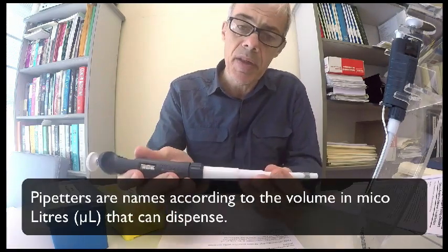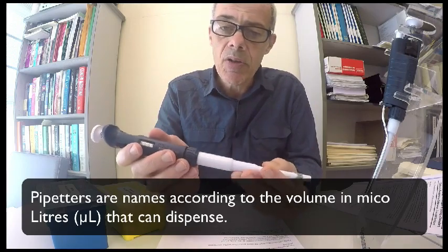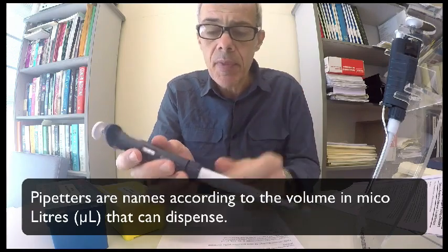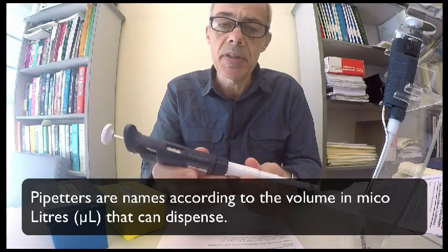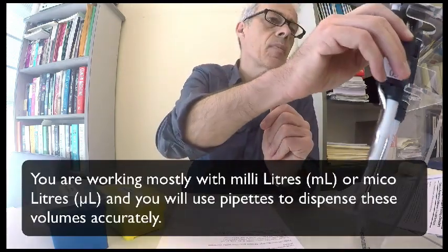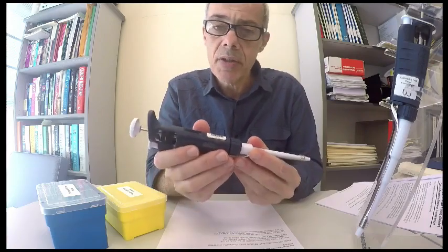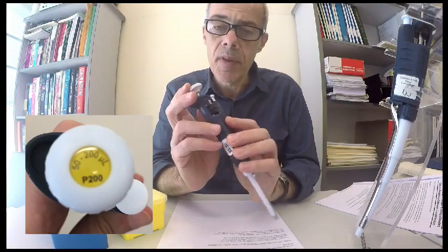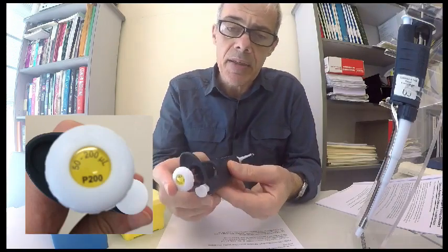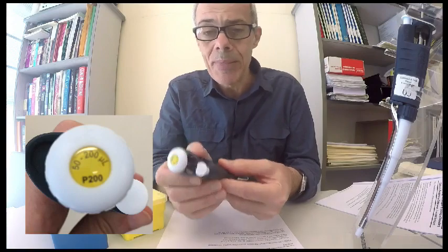So the P1000 can dispense 1,000 units of something. That's 1,000 microliters. There are 1,000 microliters in 1 milliliter. Therefore, the maximum volume this can dispense is 1 milliliter, which is the same as 1,000 microliters. This is a very similar pipette, but this one dispenses a smaller volume. And if you read the top here, it's a P200, meaning the maximum volume it can dispense is 200 microliters, which is the same as 0.2 of a milliliter.